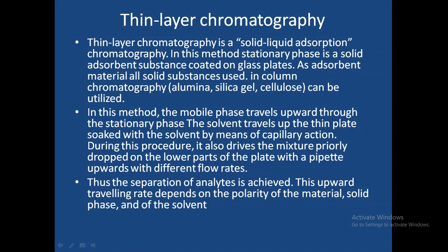In this method, the mobile phase travels upward through the stationary phase. The solvent travels up the thin plate soaked with the solvent by means of capillary action. During this procedure, it also carries the mixture, previously dropped on the lower part of the plate with a pipette, upwards with different flow rates. Thus, the separation of analytes is achieved. This upward travelling rate depends on the polarity of the material, the solid phase, and of the solvent.